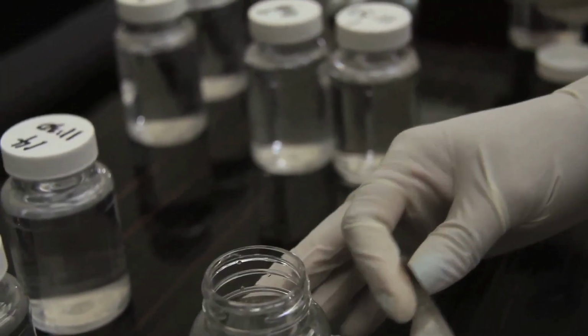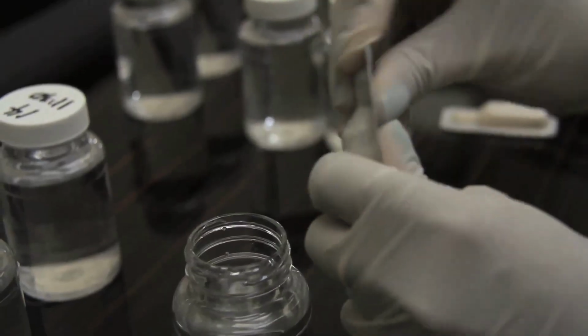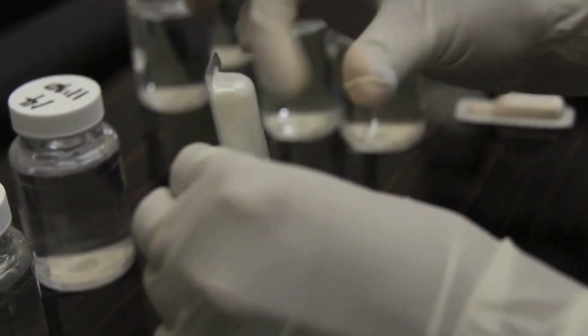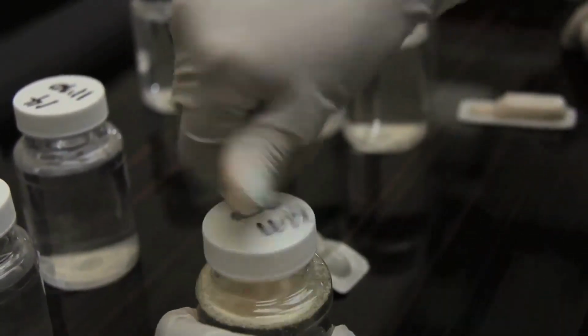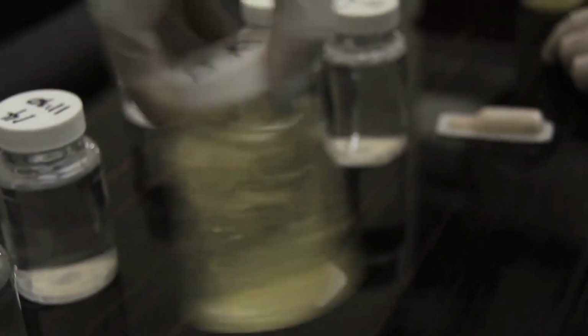First, we get this water sample and we get the Colilert, which is the reactant to tell if there's any coliforms. And you open it like this and put the sample in there. Make sure you get as much as you can in there. And then you want to cap the bottle tightly and stir it this way and not shake it hard because you don't want too many bubbles forming. And you want to stir it until all the powder has dissolved into the sample.